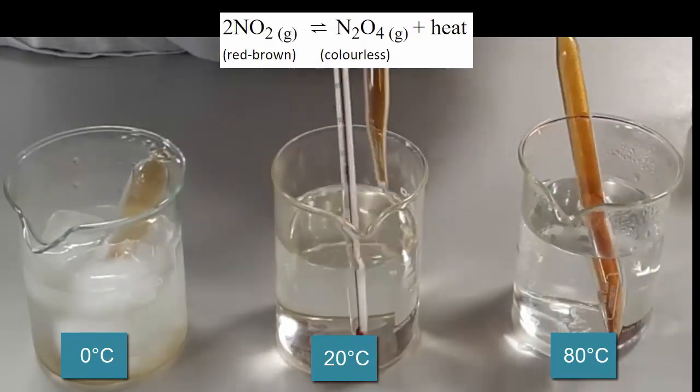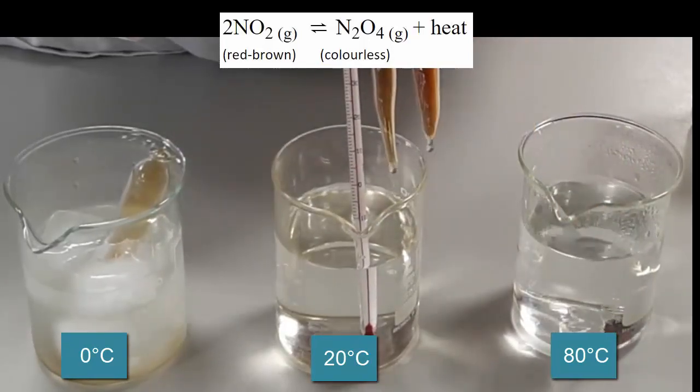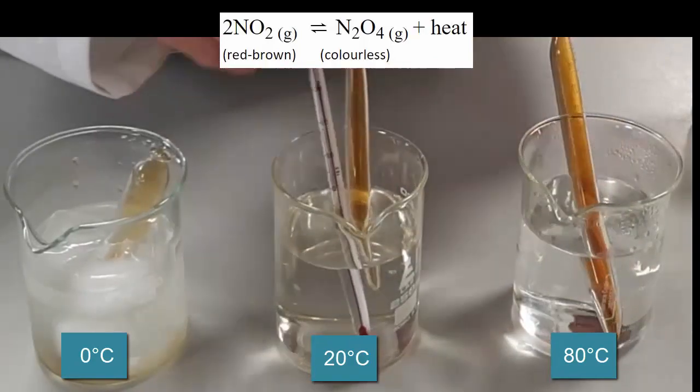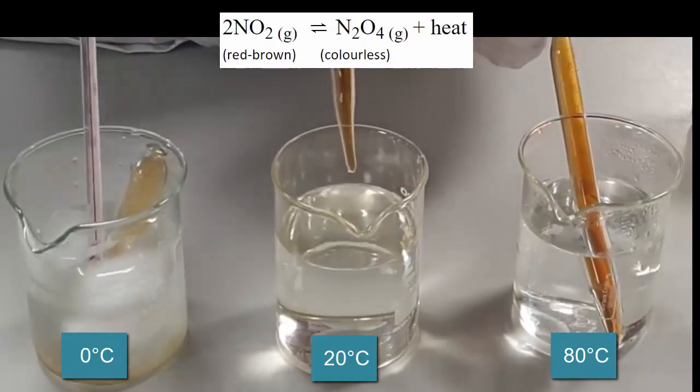And so you can see that removing heat pulls it to the right hand side, which is colorless, and adding heat pulls it to the left hand side, which makes it darker.